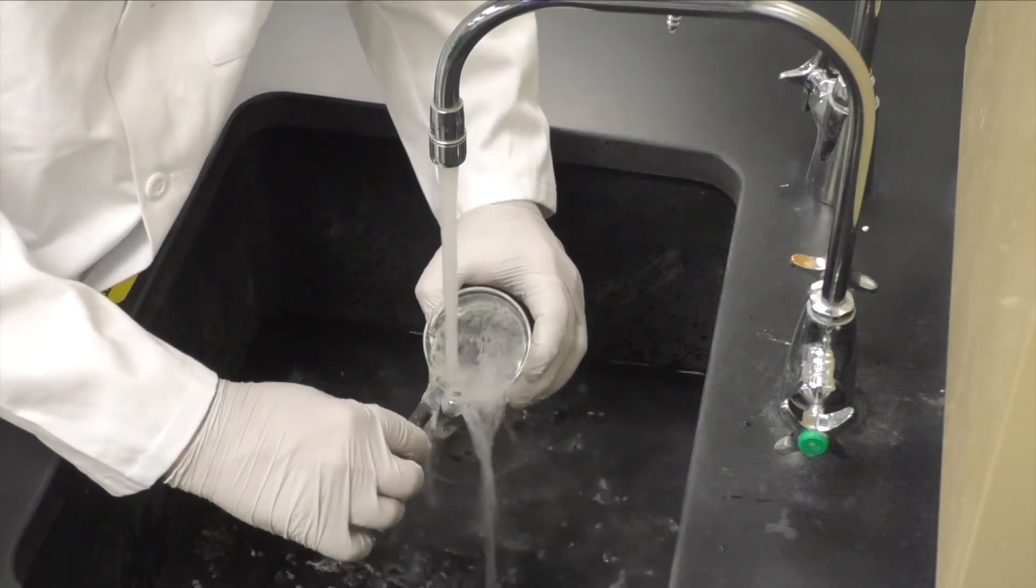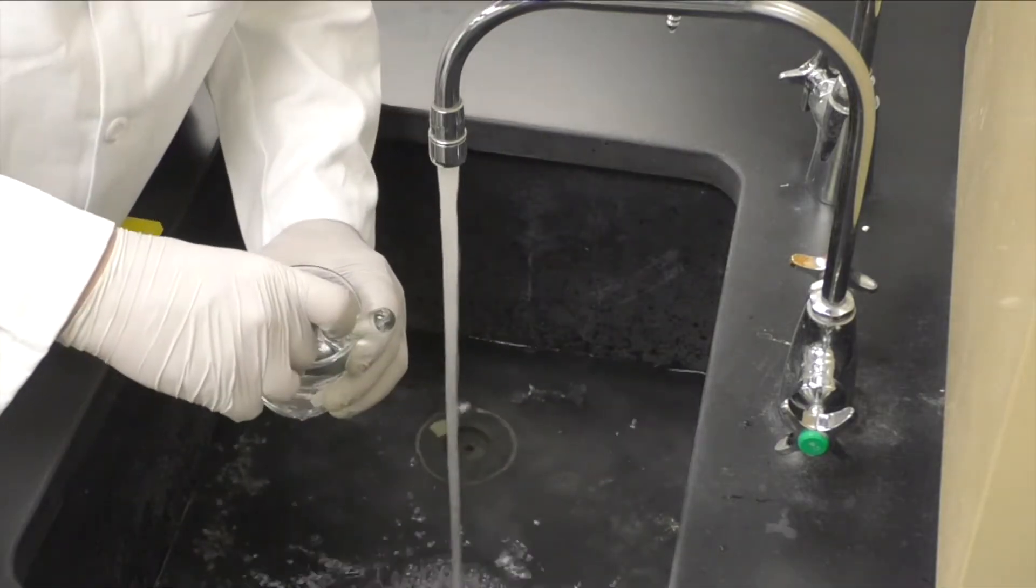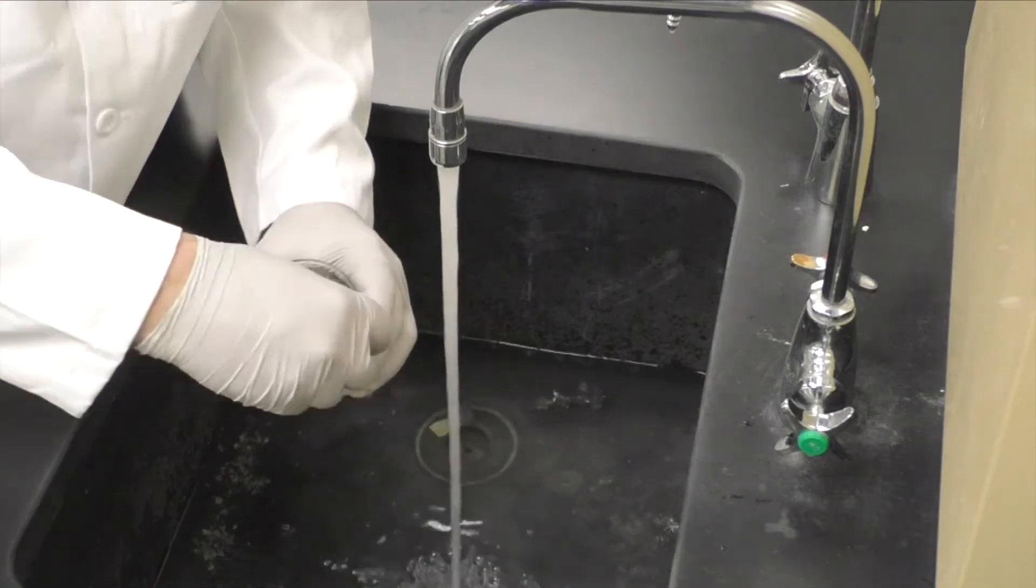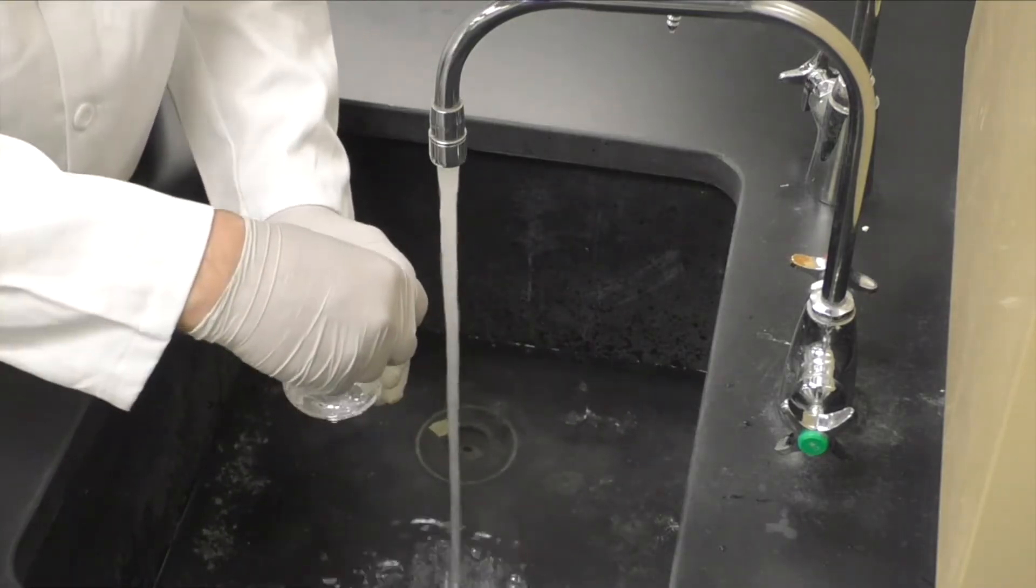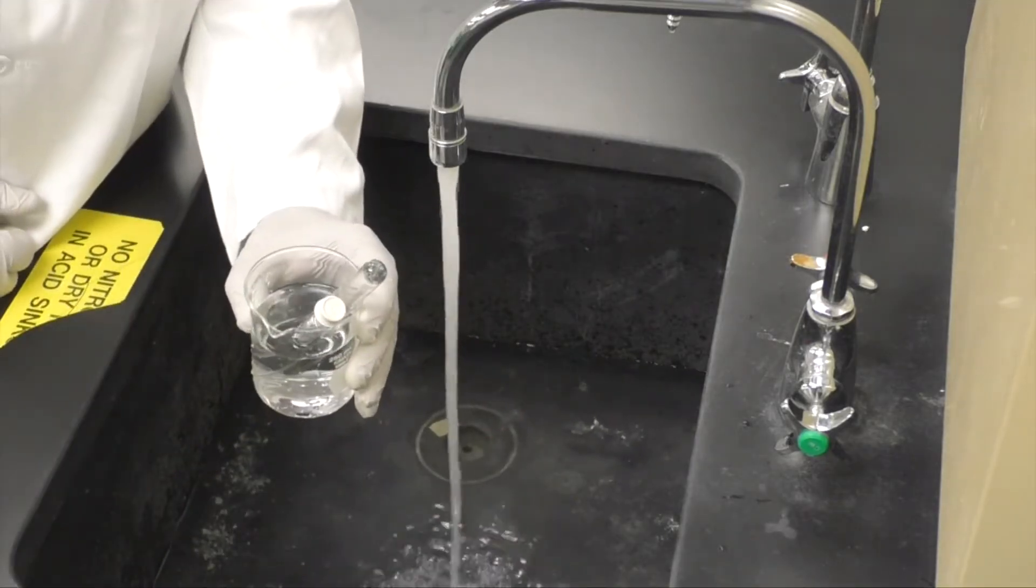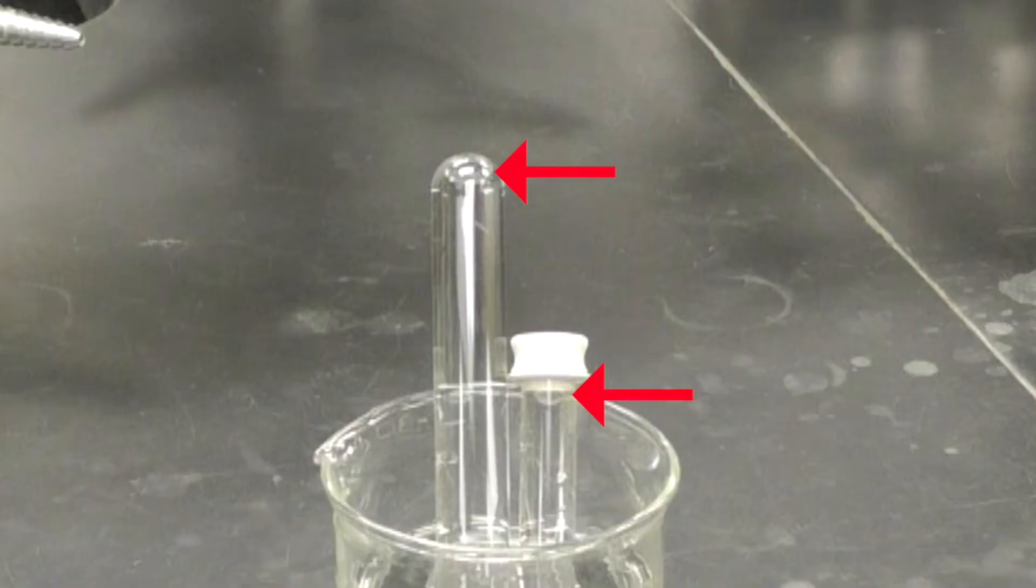Repeat the process with the gas collection tube. Then pour a little bit of the water out of the beaker so that it is only about two-thirds full. If you have a small air bubble at the top of each tube, that's fine.